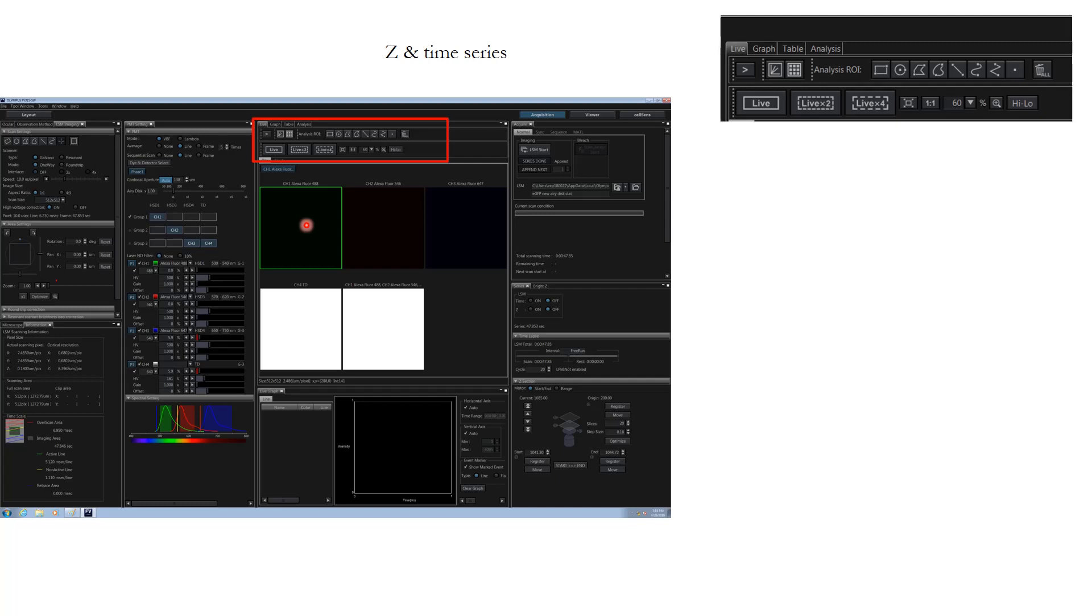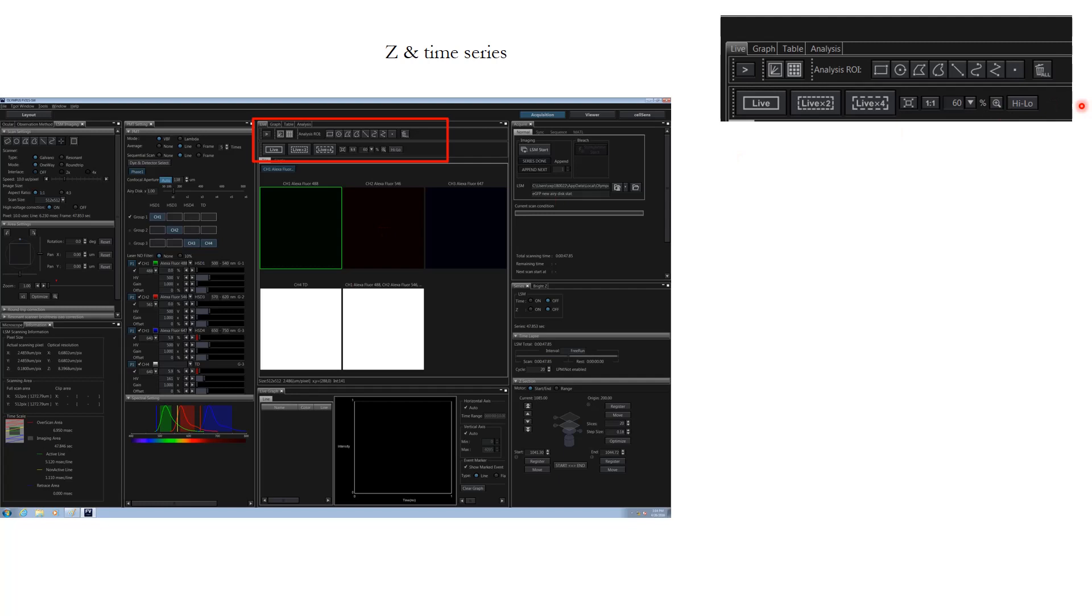Similar is the situation for the microscope. When you have a lot of laser intensity coming in or very high voltage, you end up having so much signal that the detector is not able to see the details. On one side it is bad for the imaging, and on the other hand it is also in the long run not good for the detector. So it's always a good idea to make sure that there are no red pixels in the high low mode in your image.